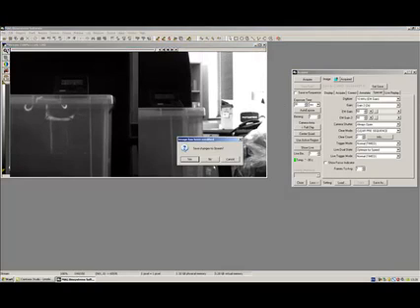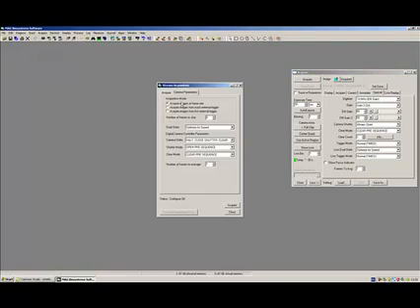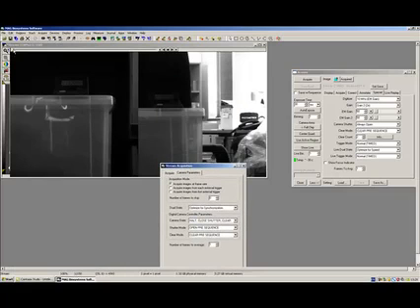If I close this one down, and then come back over to my stream acquisition, if I select to optimize for synchronization and then click acquire, it's going to take actually much longer for the acquisition. So I'm now not going to be getting the full frame rate of the camera, so this is not going to be going at my 30 frames a second as we asked for. So if we hold on a moment while this one just acquires through, if I play through this movie here now, again we would have expected 5 seconds, but it's actually taken 13 seconds to acquire.